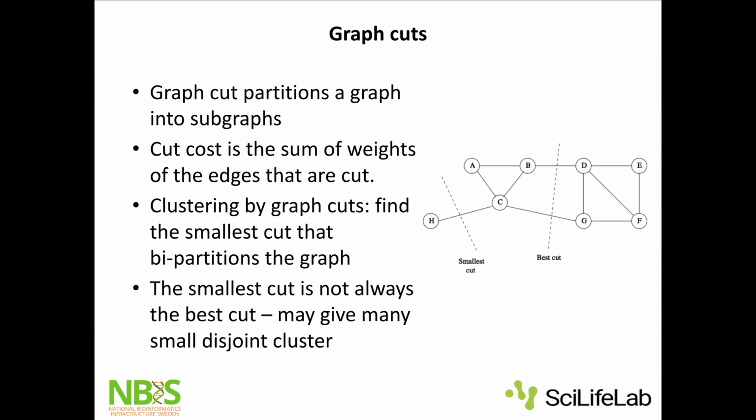That's exactly what I said. So to find these communities, we need to cut edges. So we cut it into subgraphs, and we calculate the cost of cutting.